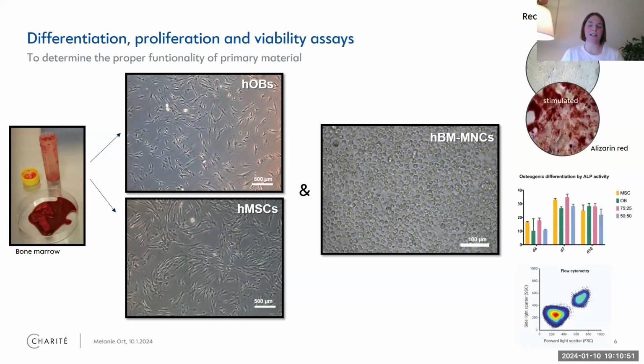So lots of our people in the lab then quality check those cells. We want to know if they actually make bone, right? So we do regular in vitro assays, so 2D. We stain the matrix and look at different aspects. Do they form matrix? Is it going in the osteogenic direction? With that, we do alizarin red staining, who's familiar with this, and also look at alkaline phosphatase, which is responsible for accumulating phosphate to then make new bone.